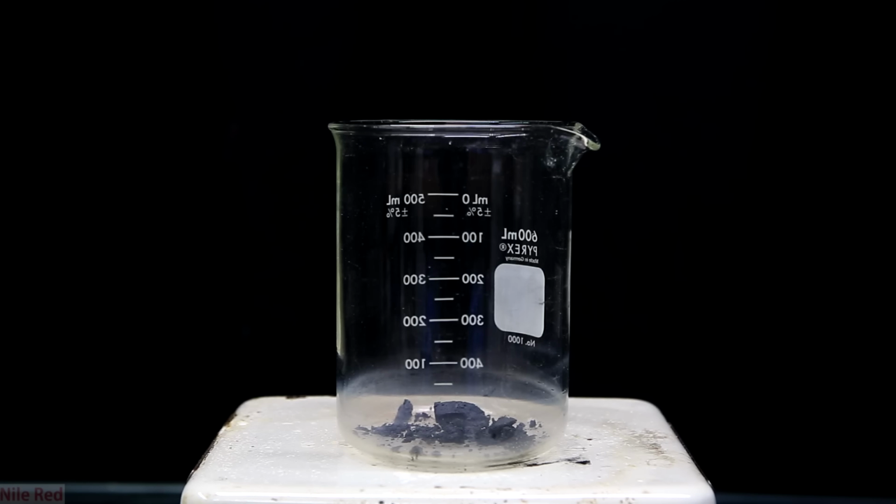After doing a little bit of research, I found that it's a pretty common belief that iodine cannot be a liquid at atmospheric pressure. I'm going to be totally honest and say that I was one of these people who was always taught this. When carrying out this purification step, though, I did notice that the iodine was liquefied, and that really made me question what I had learned.